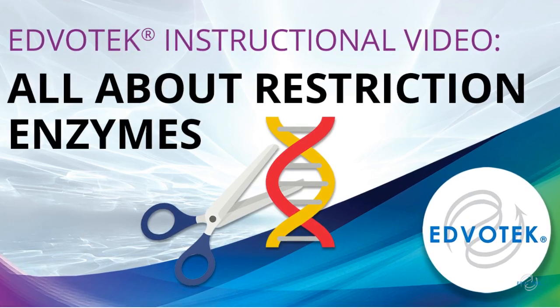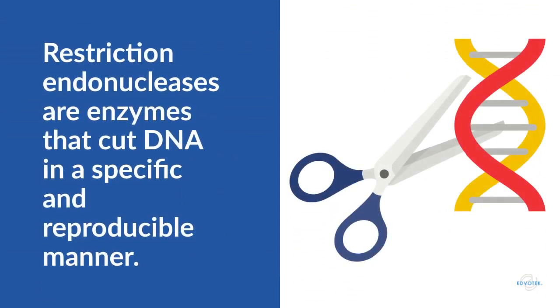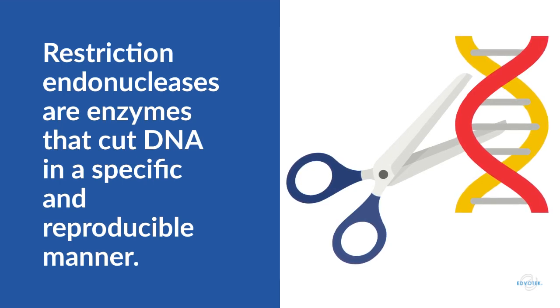Edvotek instructional video, all about restriction enzymes. Restriction endonucleases are one of the most significant discoveries of molecular biology. These enzymes can cut DNA in a specific and reproducible manner.